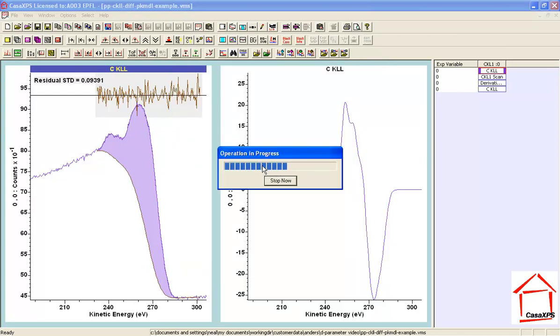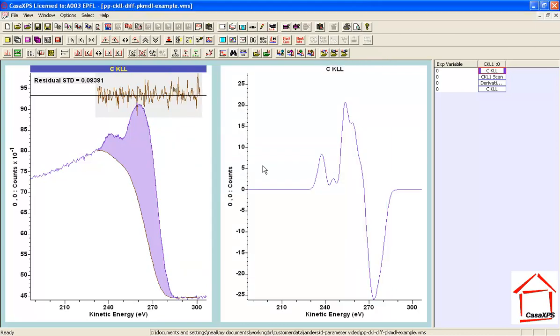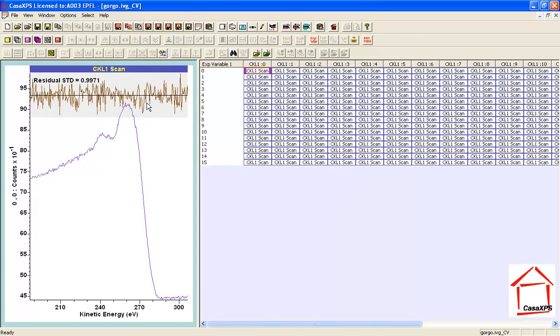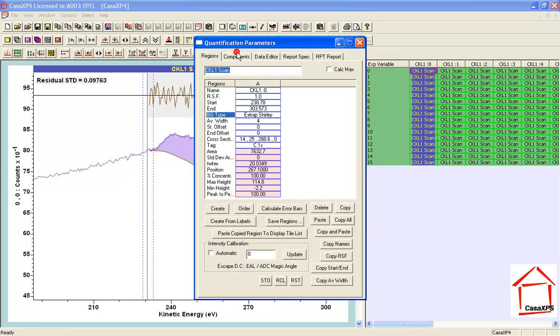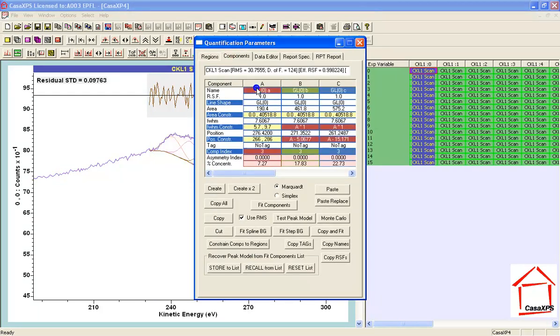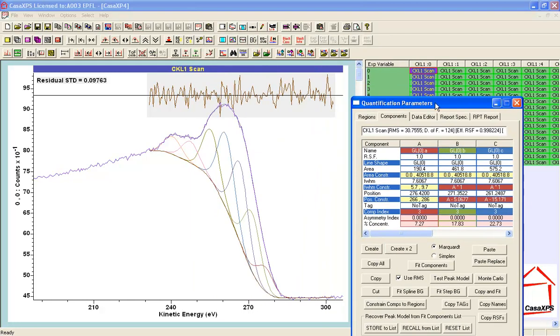And the operation proceeds, and when it is completed we can go back to the file that contains the selected VAMAS blocks. The display mode still does not have the regions selected. Now it does. I can even turn off the use of the component index to color, so we can see the components individually.